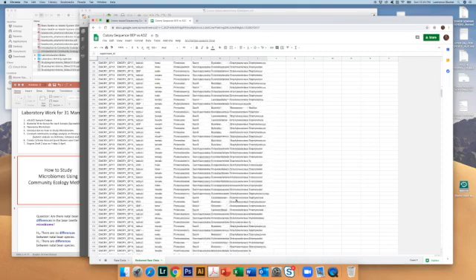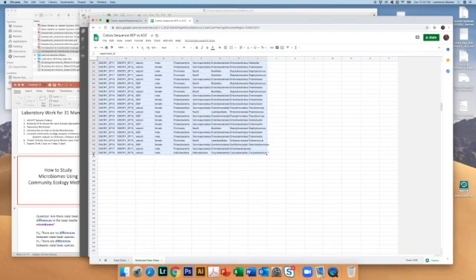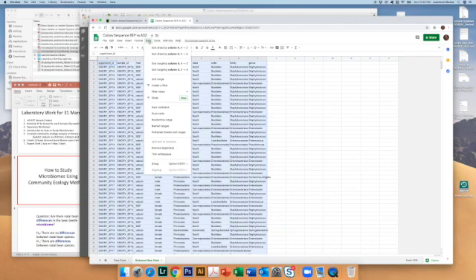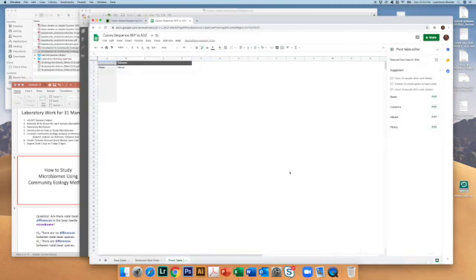That's going to ensure that when you do the pivot table command, so we're going down to row 246 and we've got columns A through I. Go to Data and go down to Pivot Table. Ask for a new sheet. Now, it's giving you some choices. It's created a new tab. That's what we wanted to do.